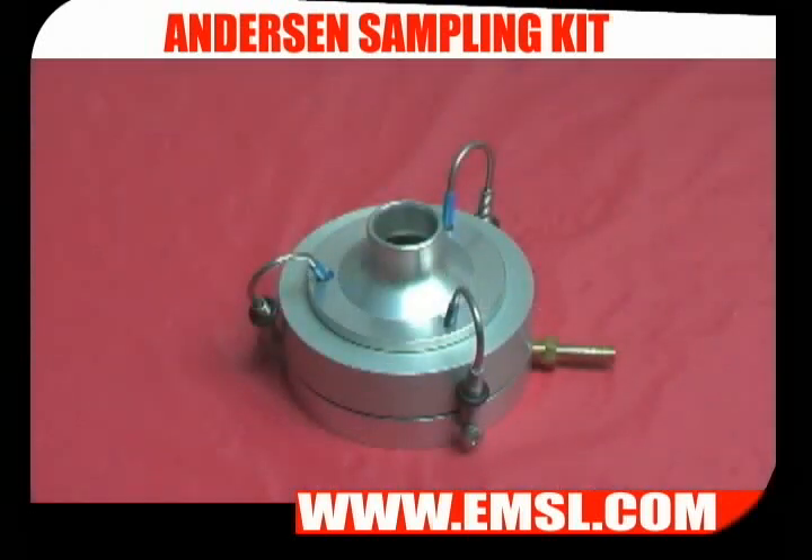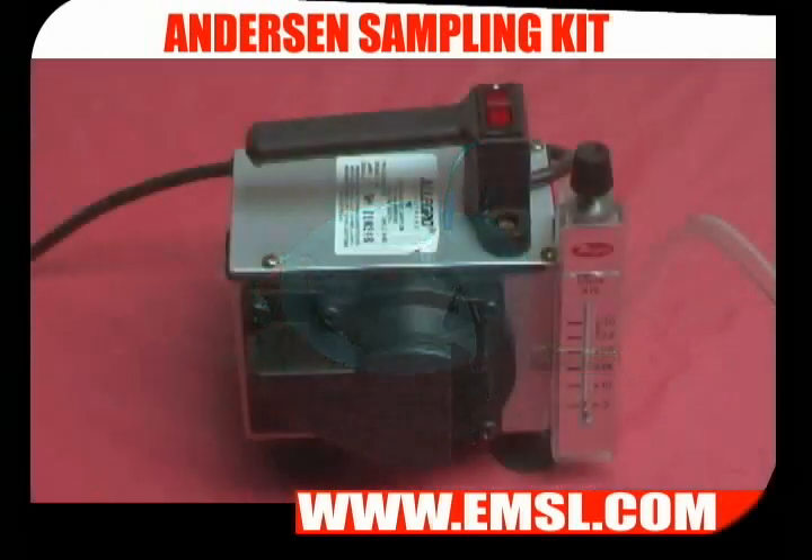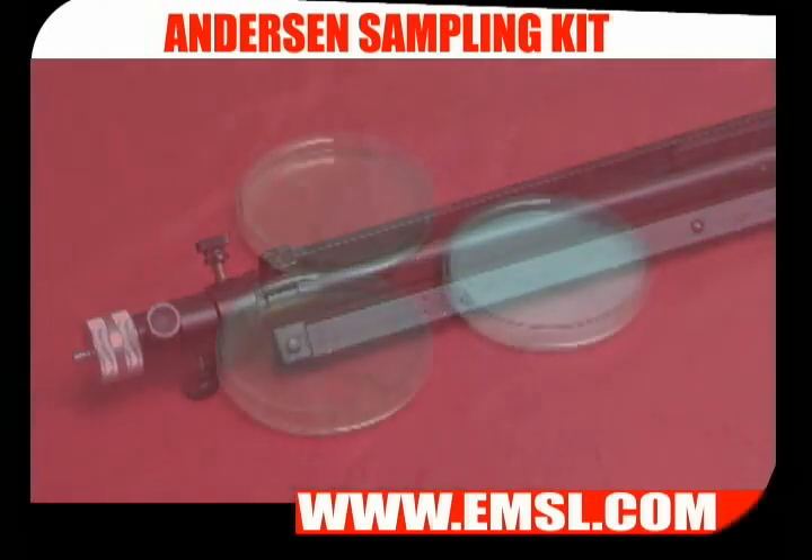In order to take an Anderson sample, you need an Anderson type impactor, a high-volume sampling pump, a tripod, and agar plates.